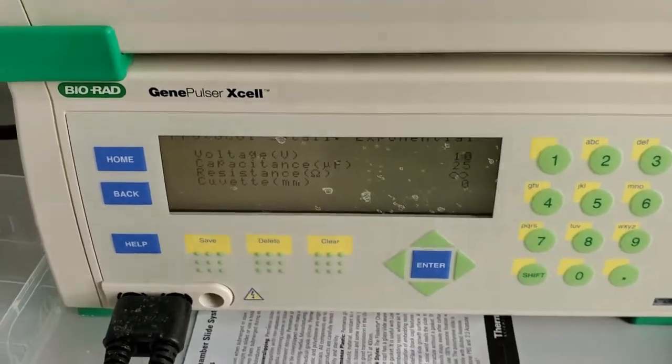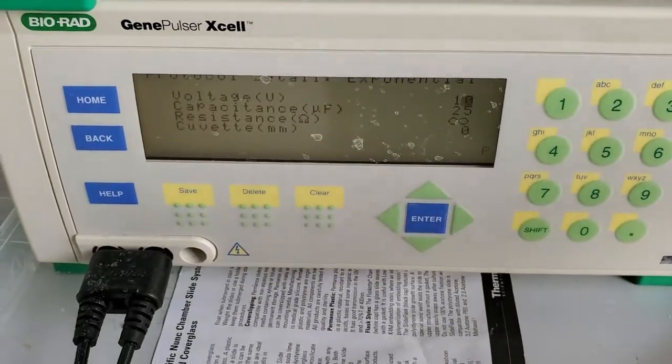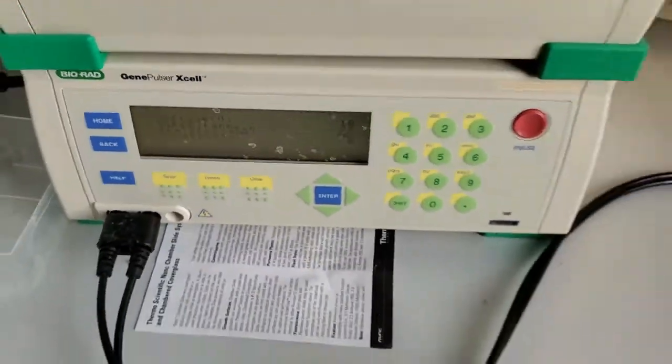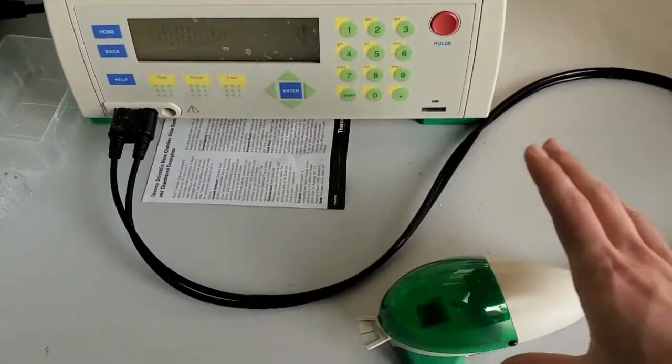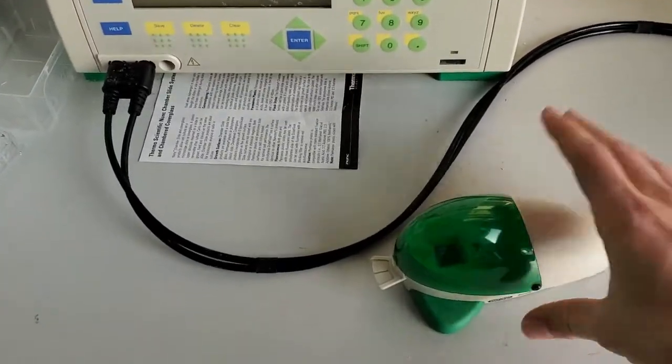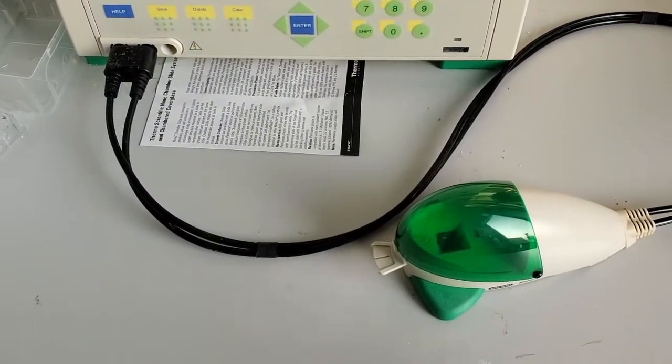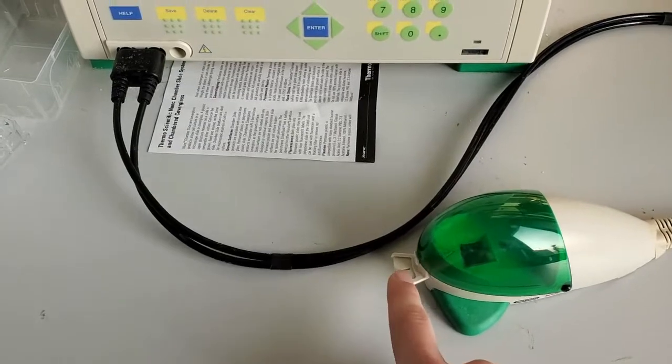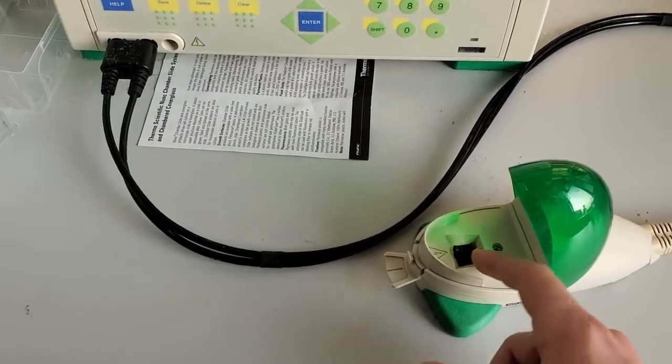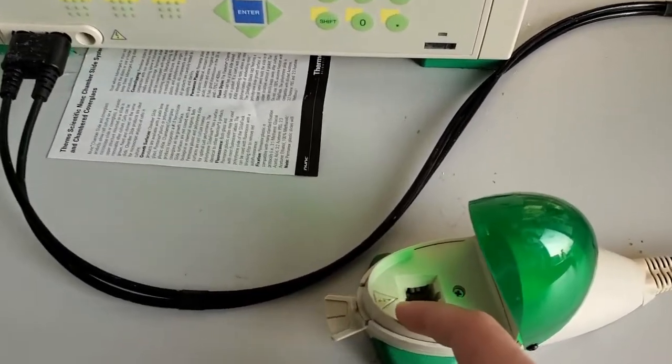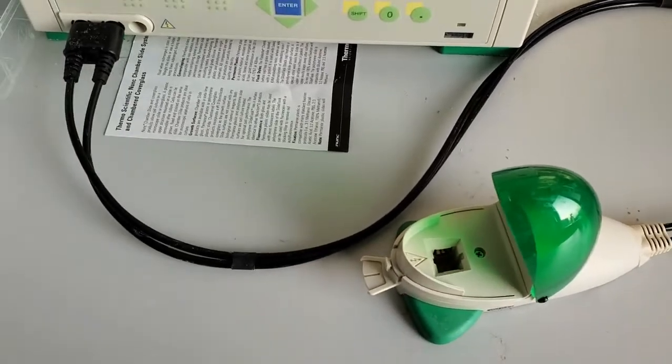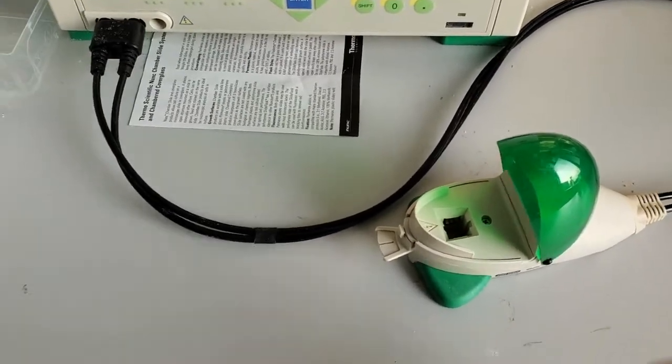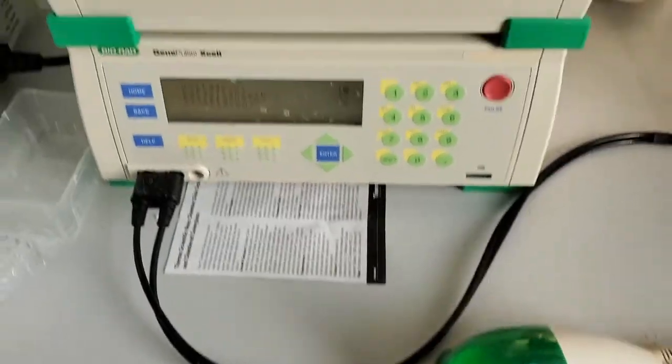So once you have all those settings set, you can then go to this guy, which I always think kind of looks a bit like a whale or something. Open it up. You'd put in your cuvette here. There's little notches so that the cuvette goes in the right way. Close that up.